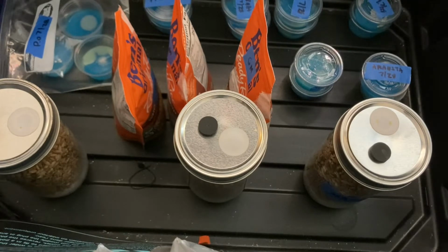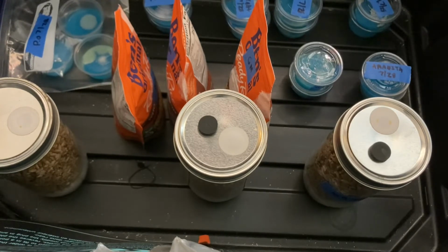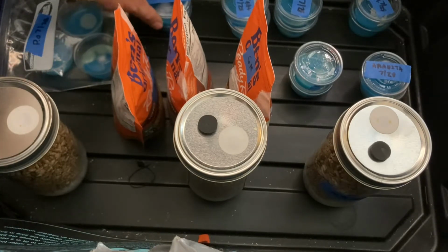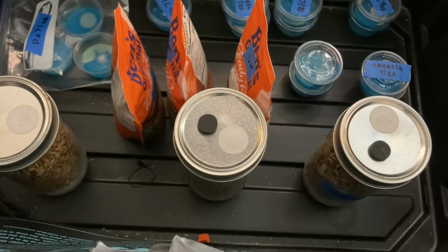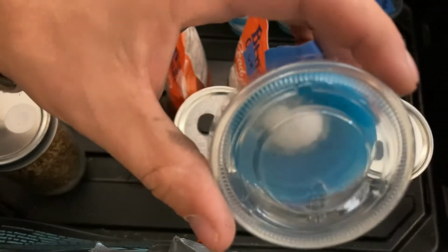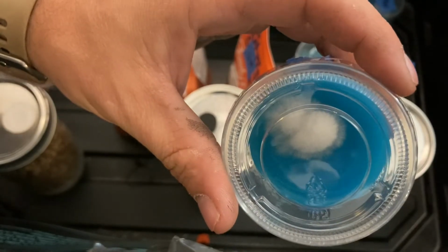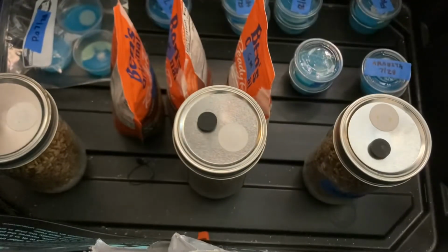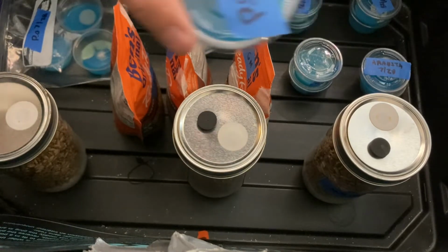But basically in our back left corner over here is where we have our pearl oyster petri dishes going, and we actually have some growth to show you. So this one here, I checked out a few days ago, and it is actually doing really good. Got some nice rhizomorphic growth going on in there. Doesn't look like we have any contamination in that one. So this will probably be the one that I use to make the liquid culture, but I will show you the other ones because you always want to pick the healthiest mycelium.